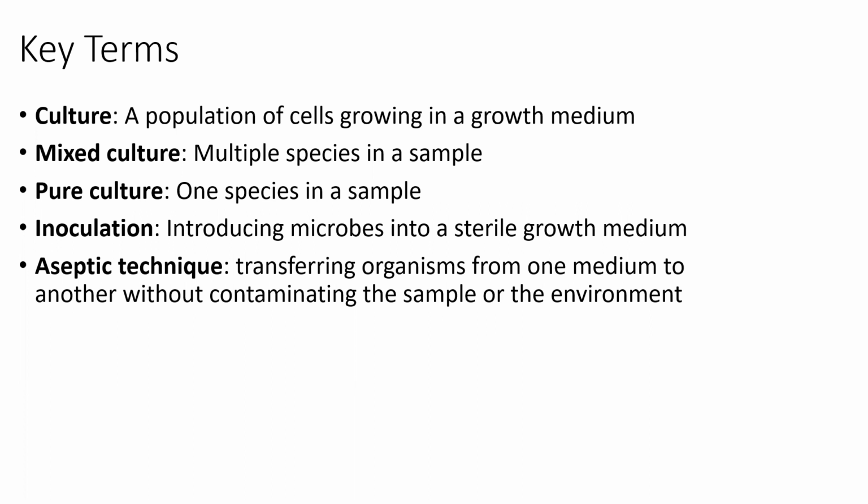Now, please know your starting media may not be a broth. It could be a slant. It could be an agar plate. Typically, broth is just the easiest for me to make and to distribute to everybody. So a lot of times your starting cultures are broth cultures, but not always. They don't have to be.